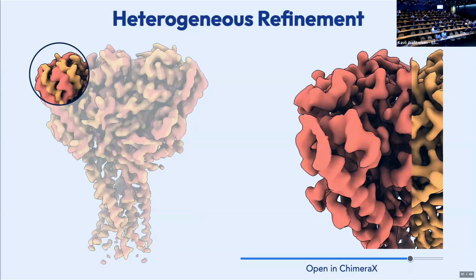And I think that's the reason why heterogeneity, generally speaking, is still the really big open frontier for cryo-EM. Methods are still being developed; techniques, strategies, everything is still in flux. And like I said, validation is still TBC. So it's an exciting area.